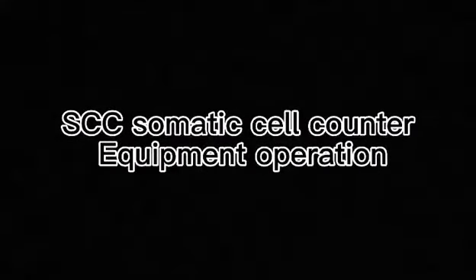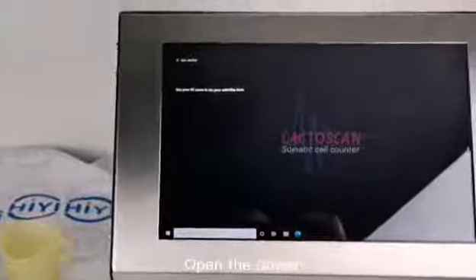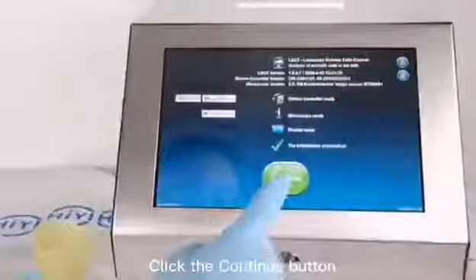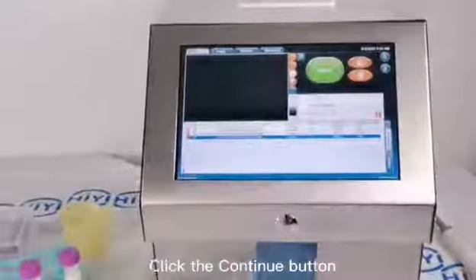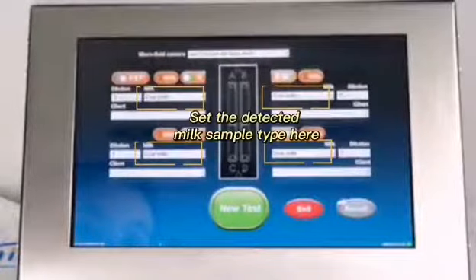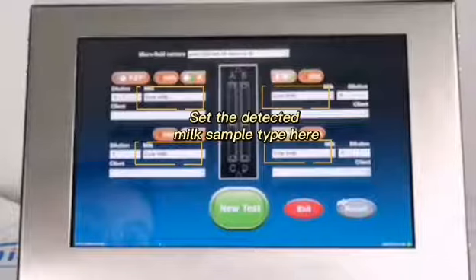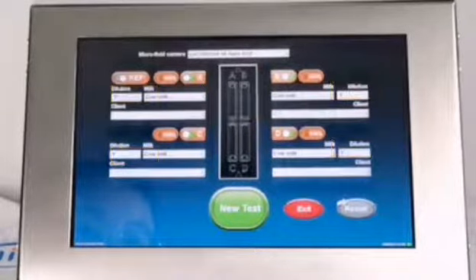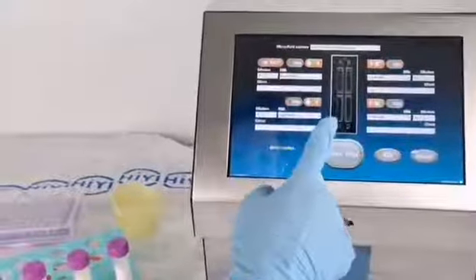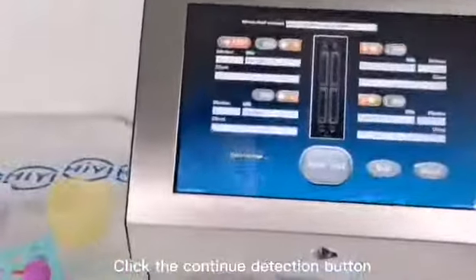Equipment operation. Open the power. Preheating. Click the continue button. Click the start button. Set the detected milk sample type here. Set the sample name here. Click the continue detection button.